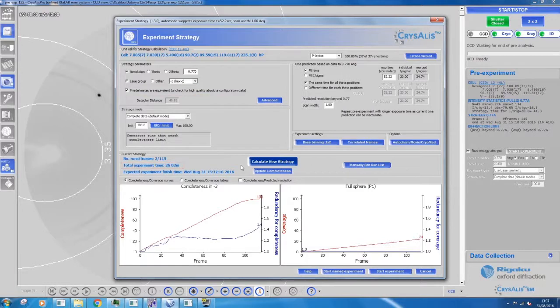With experience, you will know the effect of adjusting the exposure time. A longer exposure time will yield better results, but too long can damage the detector. Take a note of the predicted resolution. For publication purposes, one requires a data completeness of 98.5% out to a resolution of 0.837 angstroms. So adjust the time as necessary, or change the sample if unreasonable amount of time is required to achieve this.